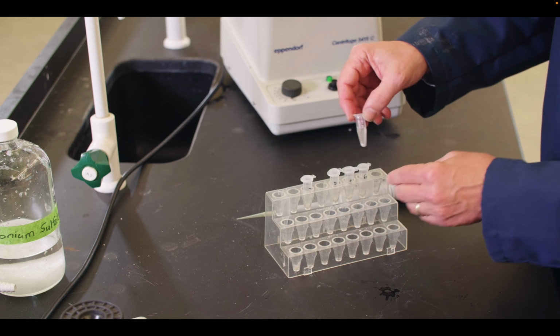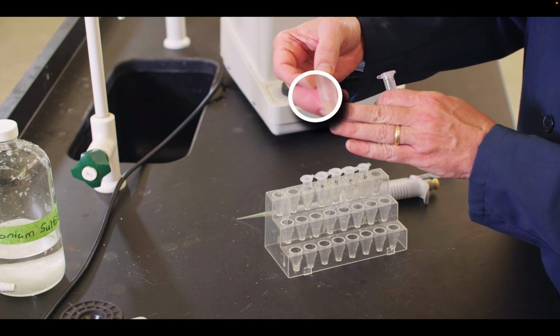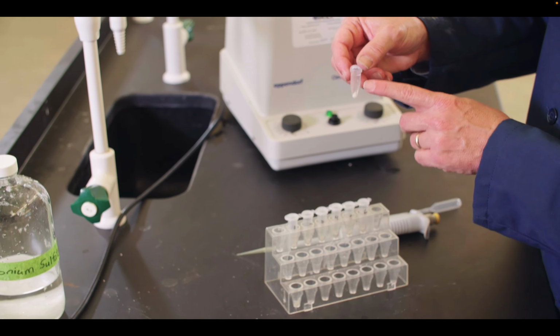Each one of them had a different amount, and this allowed us to calibrate the amount of ammonium sulfate that was important in each one. So again, remember the first one should really have no pellet. We didn't add any ammonium sulfate, so that should be our control, though you notice a little bit of color there. Our fraction 2 and 7 probably should have the most that's here.